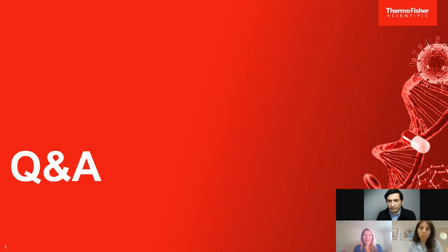Okay. Let's see. Maybe Kristian, if you'd like to jump in. This is another question, or either one of you can answer. Can mitochondria be visualized via this method? Yes, would be my answer. Yeah, you can see them, definitely. Great. Yeah, beautifully, in fact.